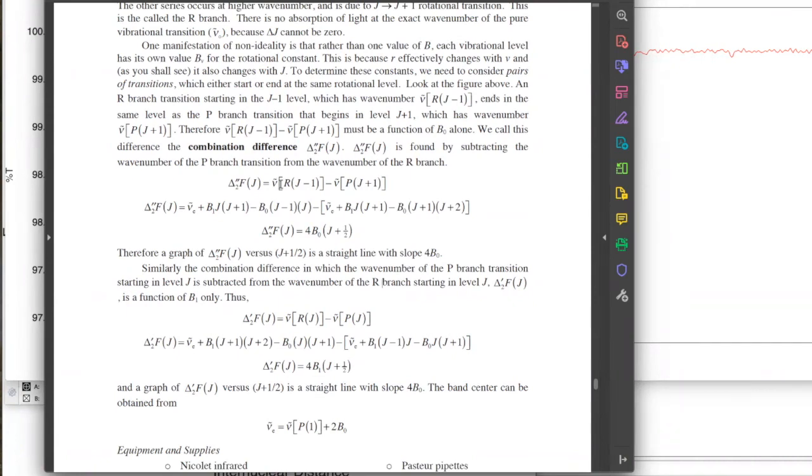Oh, wait a second. All right. We know what they started in. We've assigned the spectrum. Now we can figure out how to get them to end in the same state. So if we take the value of J, our R transitions all go up by 1, P all go down by 1. If we need them to end in the same one, we have to take the R branch transition that's 1 below our J value and the P branch transition that's 1 above the J value, and we can get them to end in the same value of J.